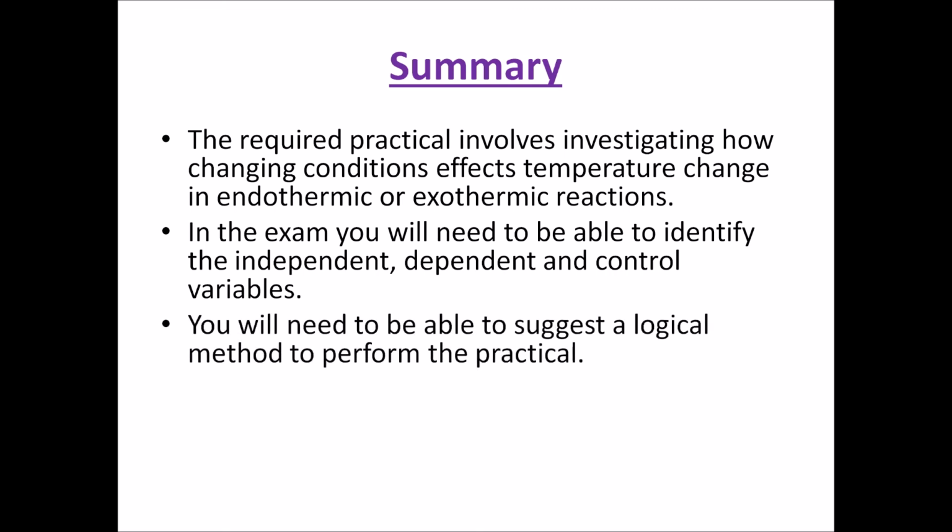You'll also potentially need to be able to suggest a logical method to perform a practical. So it might say, I don't know, Susie wants to perform an experiment. She thinks this reaction is going to be endothermic or exothermic, and changing variable X will make it more exothermic or more endothermic. Suggest a method for how she could do it. And again, you can use the basics of this method for any reaction that's going to involve either two liquids or a solid and a liquid.